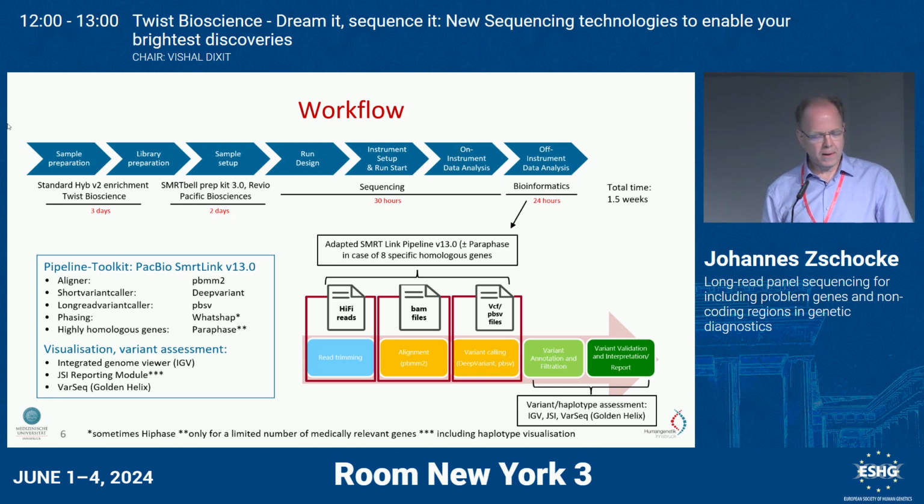So the total time for the workflow is a week and a half. The hands-on time for a dozen samples is about 12 hours, so it's about 1 hour of technician's work per sample. So it's not automated yet. I think we will automate it, but it is reasonably time effective, I would say.